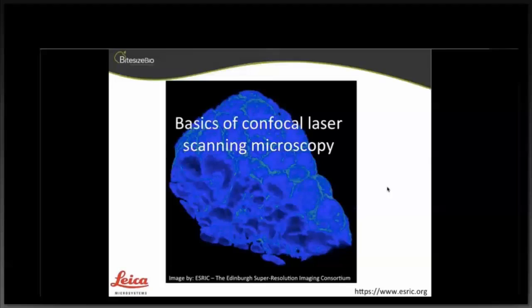Can confocal scanning microscopy be used for quantification purposes, to say, look at the differences in the expression of proteins? Yeah, I mean, it can do. I think it's something that is possible to do, but you just need to be wary that your different cells are going to have different expression. And intensity is something you can quantify, as long as you try and keep your settings all the same. There are options with certain detectors, like single photon counting or photon counting, which is more quantitative than just calculating intensity. So it is something that's possible, it's just something to do carefully.